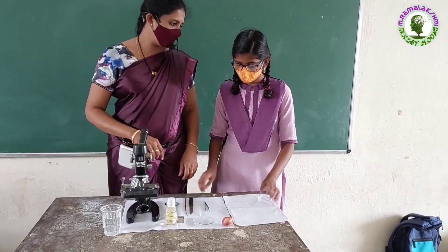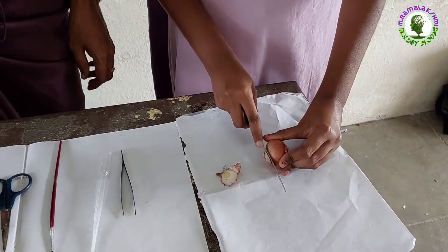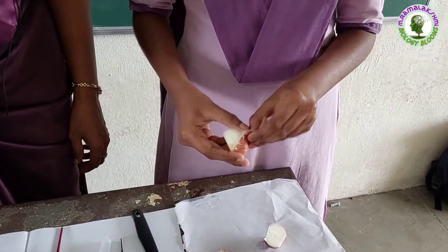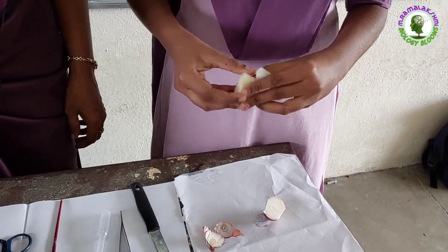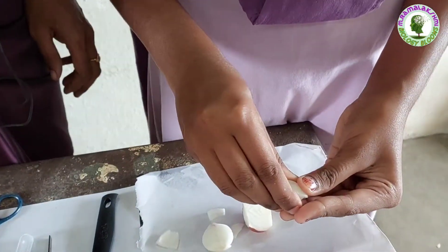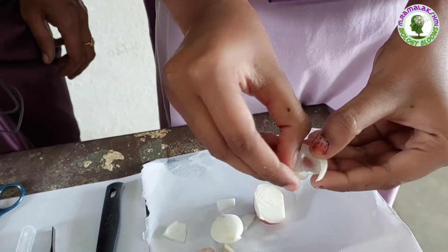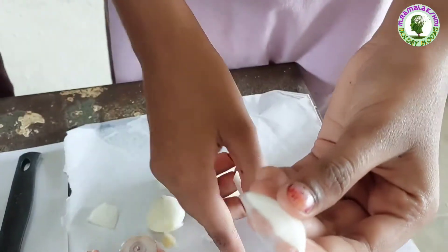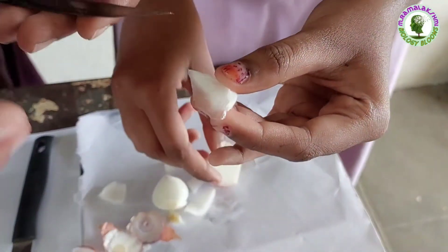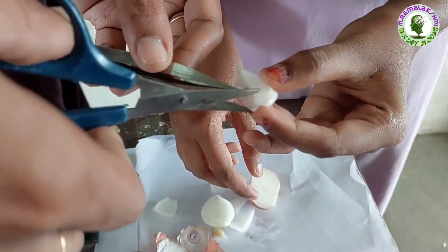Supriya, take this onion and remove the outer dry peel. Now take a small piece of onion and break it like this. Observe this transparent peel, then take it out with the help of forceps.